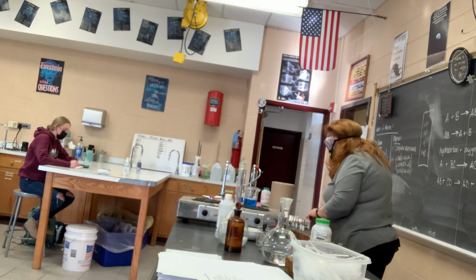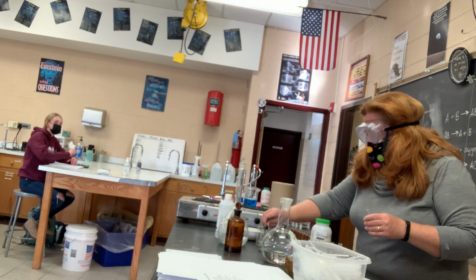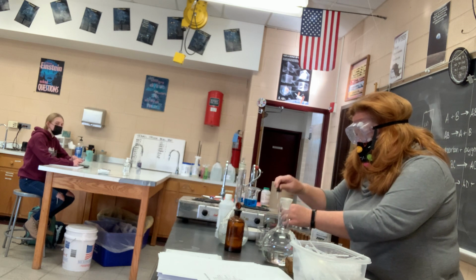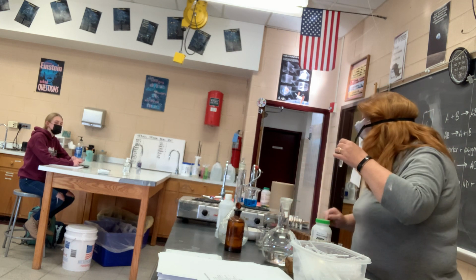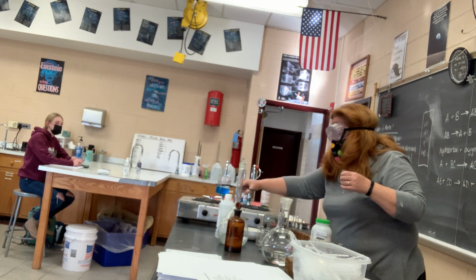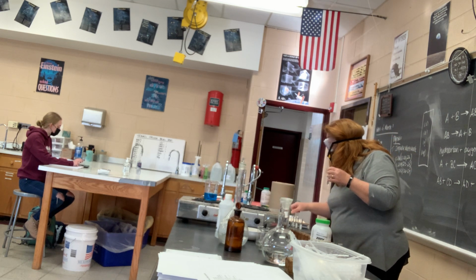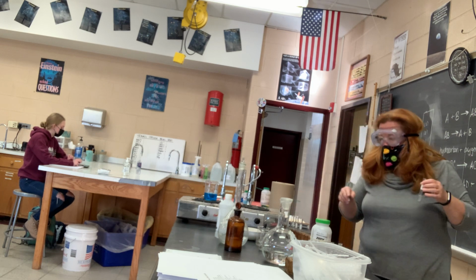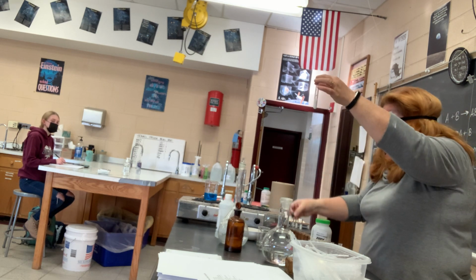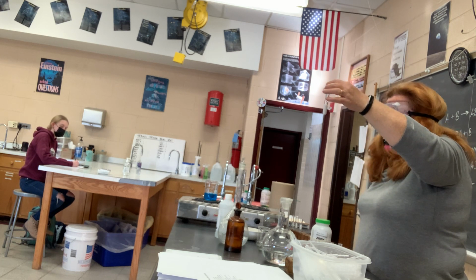It says to add 1 pipette full of silver nitrate to a clean dry test tube. Okay, silver nitrate, 1 pipette full, give or take. So it's a clear liquid. That's getting too hot. Move it over here. Okay, to the silver nitrate, salt water, I've already made the mixture, and it's a clear liquid as well. This happens really quickly. When I put it in, it makes a white powder. And that's kind of how you know that it's a reaction. 2 clear liquids just made a precipitate.